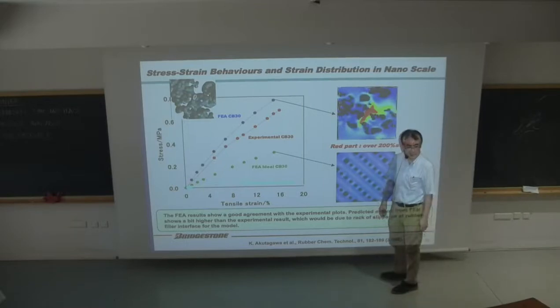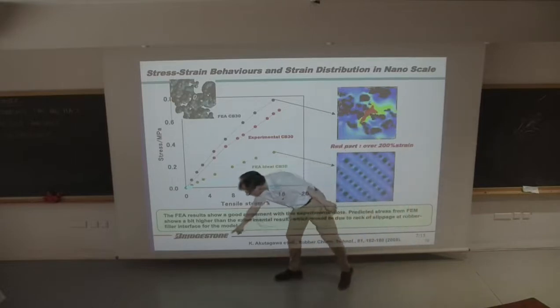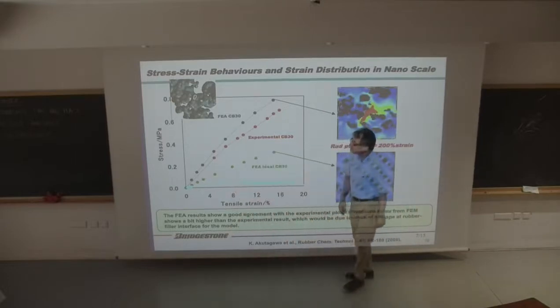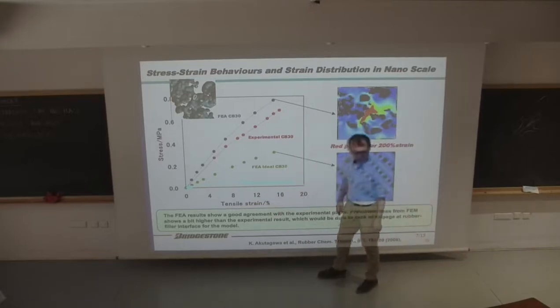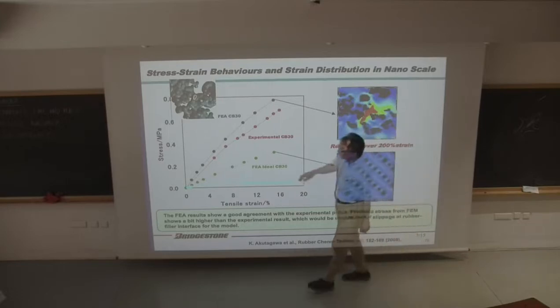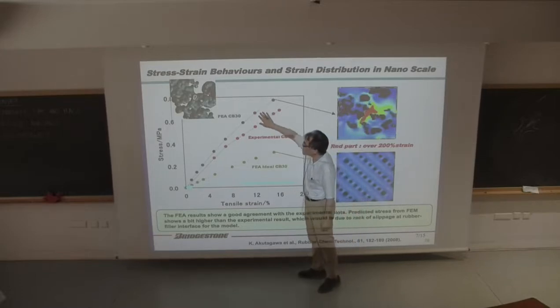One way is that you can put the three-dimensional data into the computer, and then you stretch the structure in the computer using what people call finite element analysis. Okay, so we have a collaboration with this company, and we gave them three-dimensional data, and they did the calculation. So we forget these two data. Okay, we're going to focus on these two data.